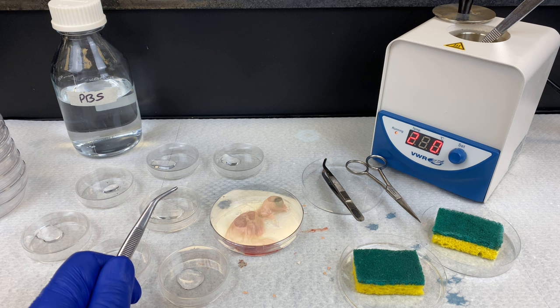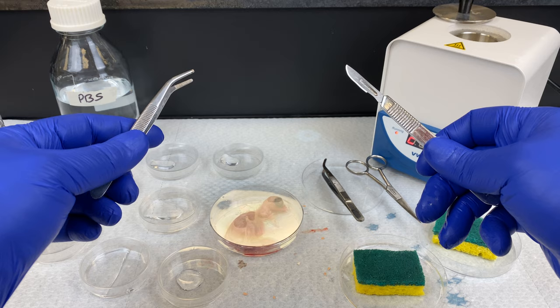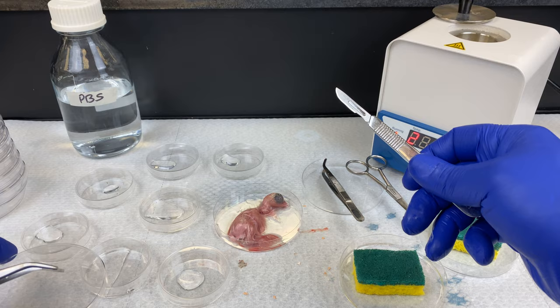Make sure all your dishes are covered up whenever possible. Only remove the lid when you're working with it. Now that our tools are clean, dry, and sterile, let them cool for a few seconds so we don't scorch the tissue.